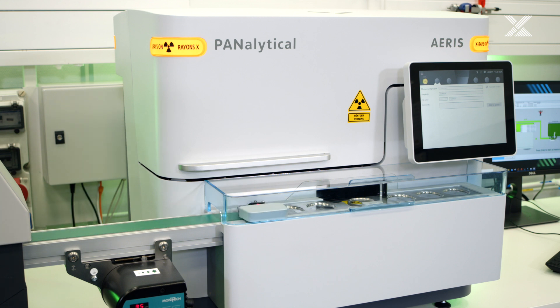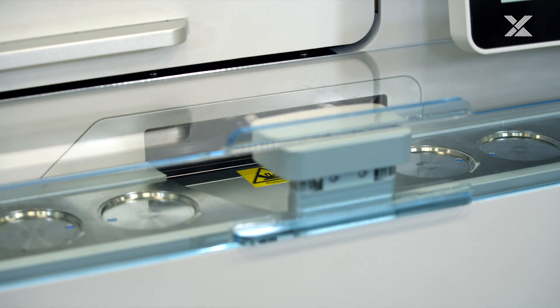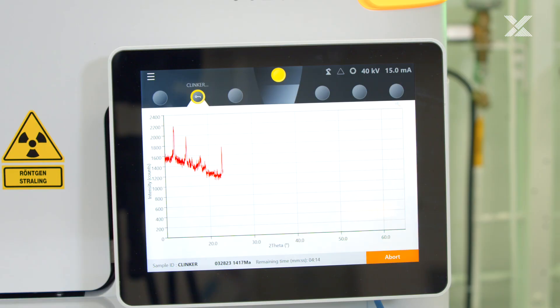The Eris performs phase identification and quantification to assess the mineralogical composition of raw materials, clinker, additives and cement, contributing to sustainable and efficient cement production.